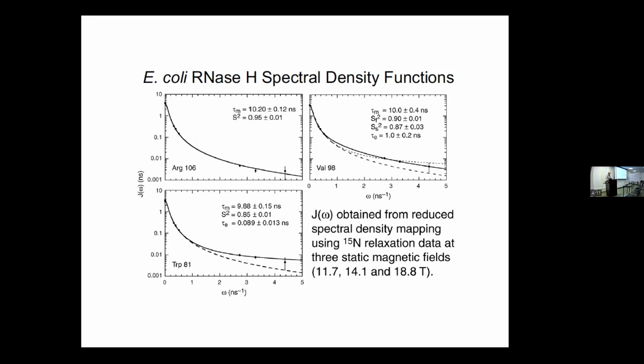And the current difficulty is that while you're moving the sample up to the low field, it's relaxing. So that has to be put into the calculations. But of course, the point of the measurement is to measure dynamics, but to do the calculation, you need to know the dynamics. It's a kind of circular problem that is still not completely solved, for us anyway. But that's the limitation here. The limitation here is we've already dropped below this rollover point.